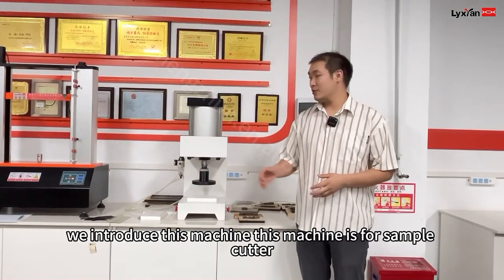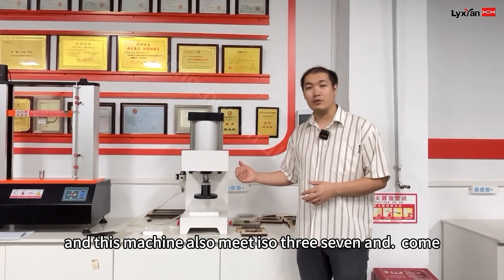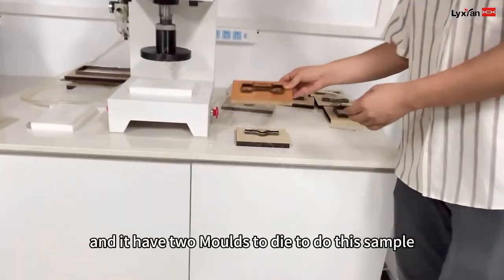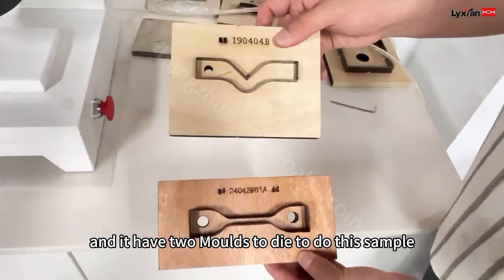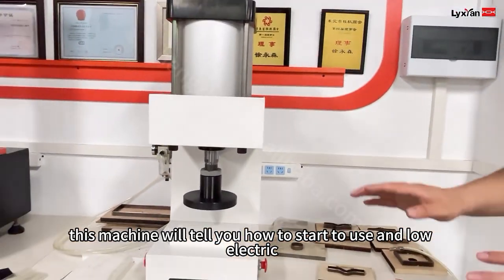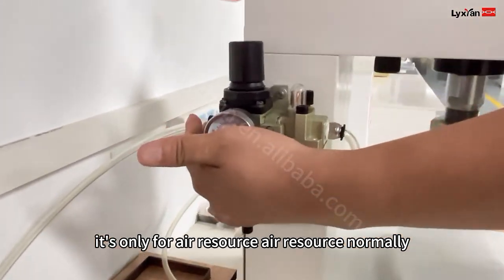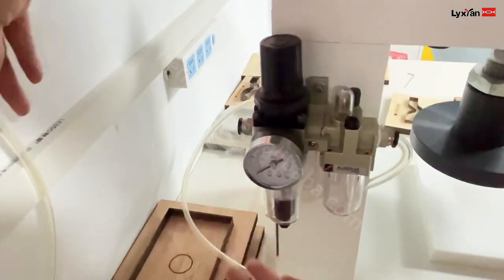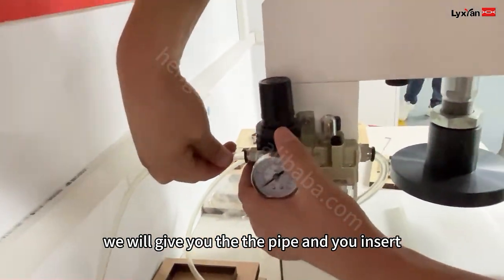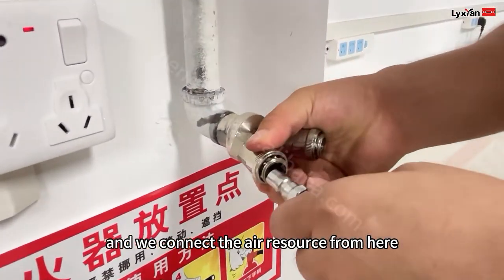Next, we introduce this machine. This machine is for the sample cutter for the rubber testing. This machine also meets ISO 37. And it has two moulds of die to do the sample. This machine will show you how to start to use it. No electric — this machine is only for air resource. Normally when you receive the machine it looks like this. We will give you the paper, and then you insert it. And you need to prepare the air resource. We connect the air resource from here.